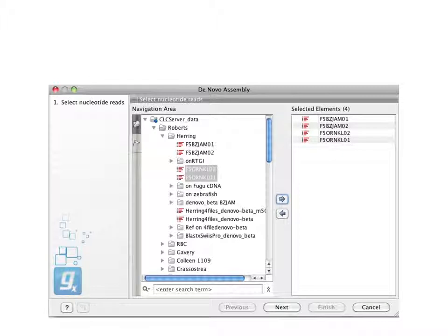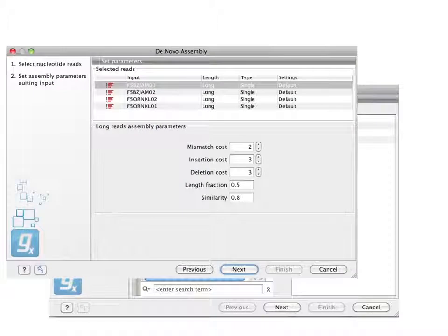So real quickly, CLC is software that costs money, that you pay for. It's not open source, but we do use it. This is probably an older version of it, but you have a directory structure. You can import data, you can do assemblies, and you can find SNPs. So this was a project several years ago. This just kind of walks you through.